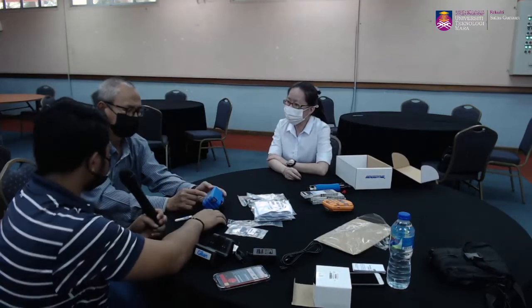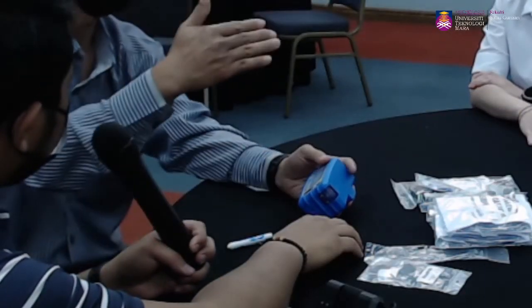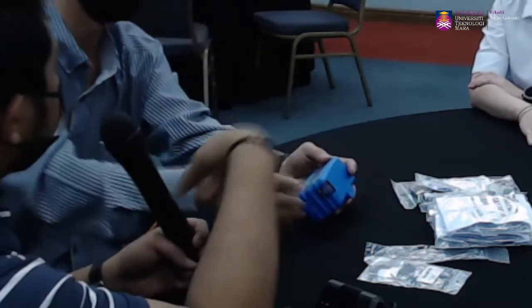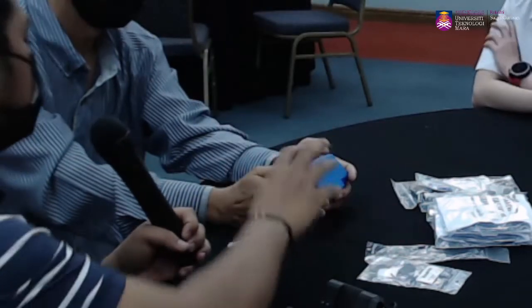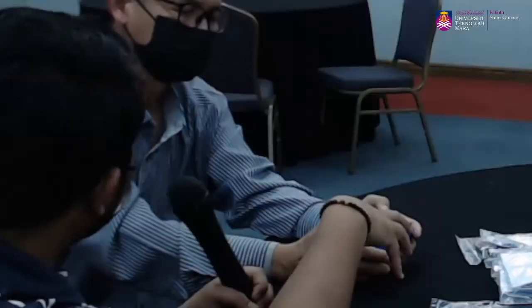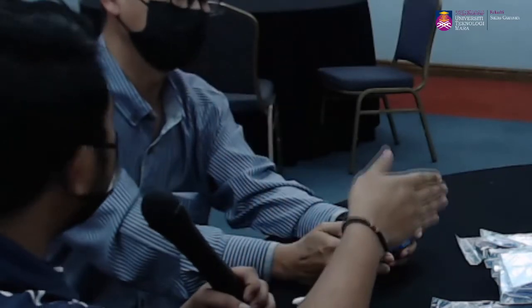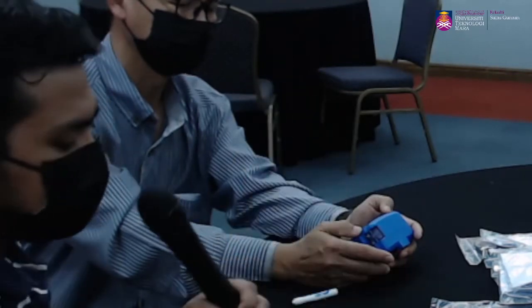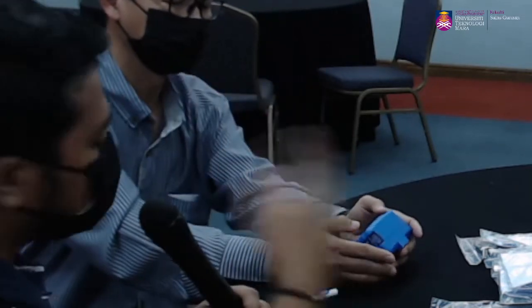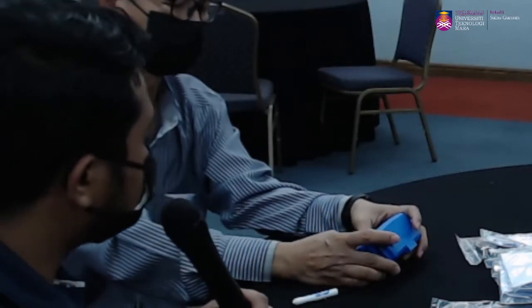Maksudnya yang kita setting flow rate ni 1000, dia akan capai pada 1000, lepas tu dia maintain. Sebab penggunaan SMM pump ni ialah kita akan pasangkan filter media depending on NMAM tu, and then kita setkan flow rate based on NMAM tu. So once kita dah set 1000, memang dia sampai habis kita monitor dia kena maintain 1000. Itu sebab yang advance pun dia akan 1000. Waktu habis pun mesti kena 1000. Itu yang daripada application ni kita boleh tengok whether dia maintain 1000 daripada awal sampai habis ataupun tak. Itulah advantage dia kat situ. Kalau in terms of ada yang data logging punya dan analysis, kita boleh buat analysis daripada situ.